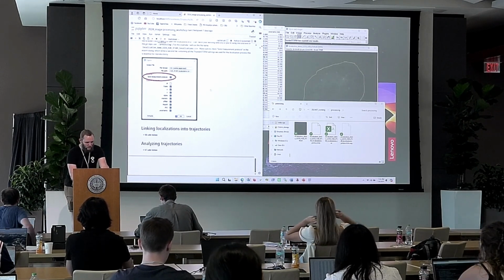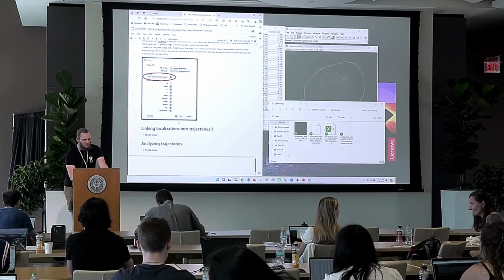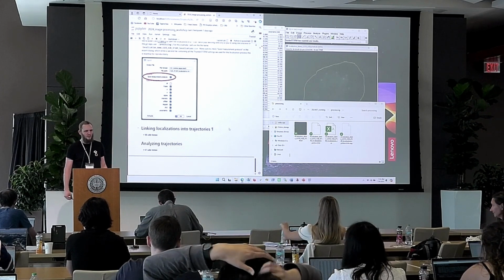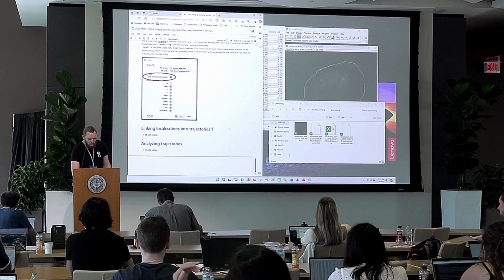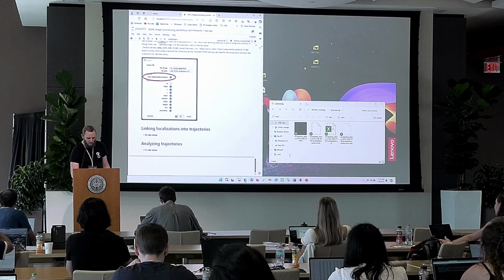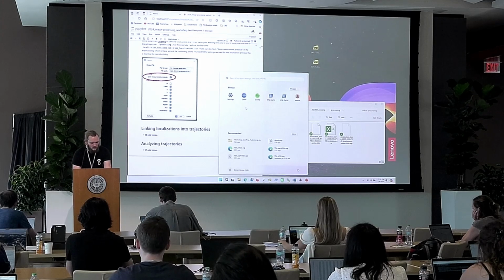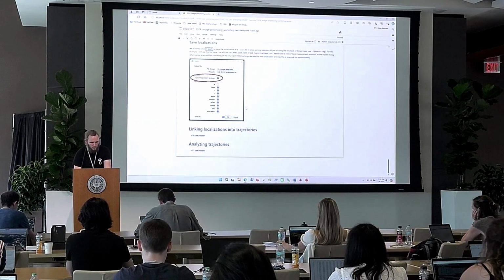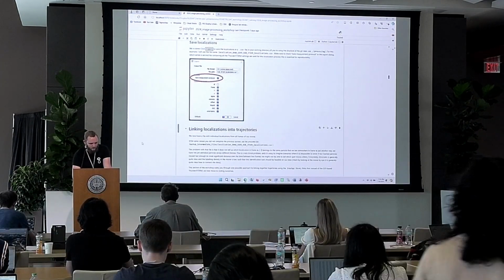For these remaining two sections, I will be working in this Jupyter notebook. I hope you can open it on Google Colab, as I showed you in the beginning, or on your local machine, whatever works best for you. We can basically just close everything associated with the movie itself and get going with our notebook. So let's build things into trajectories.